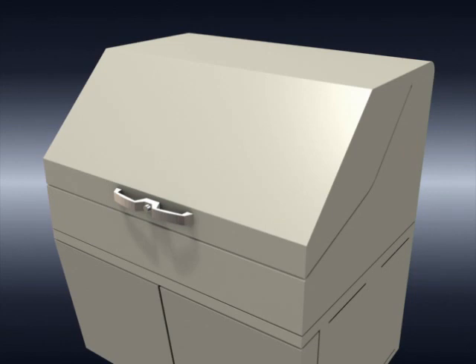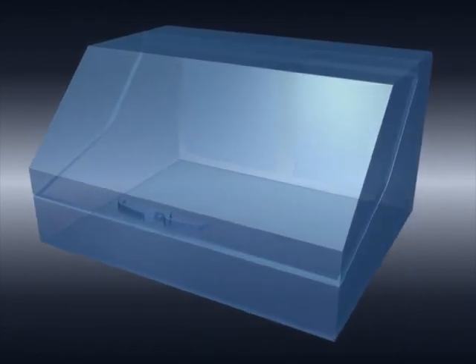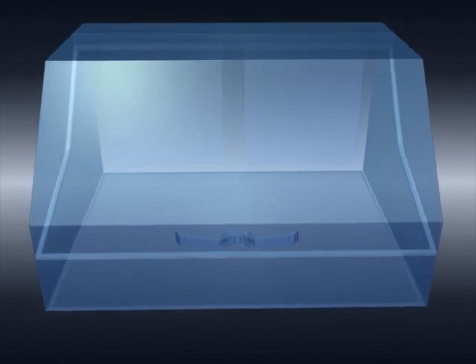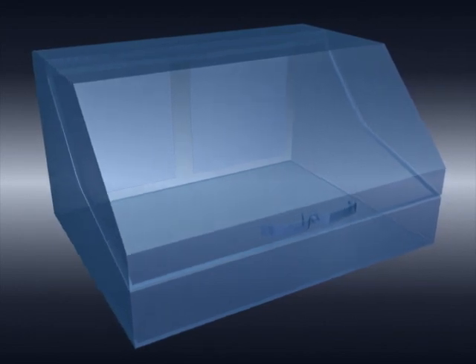The second major feature of the SolidSpec 3700 is its ability to measure in the deep UV region. With further miniaturization of semiconductor circuits, spectral measurement in the ArF laser region is becoming increasingly important. The SolidSpec 3700 DUV, the deep ultraviolet version of the SolidSpec 3700, allows measurement in this region.